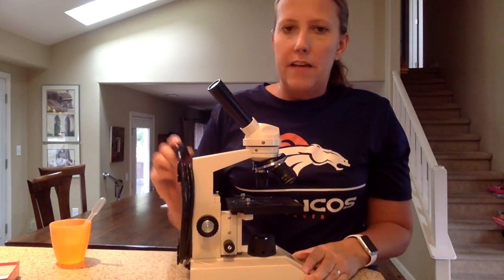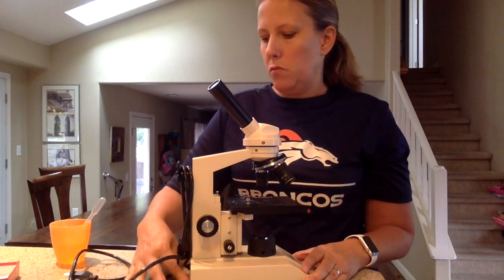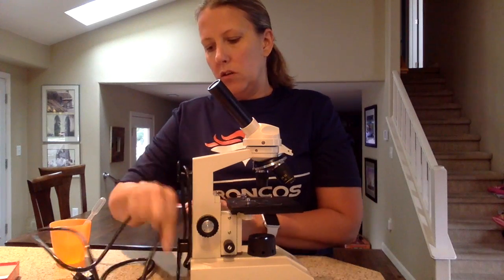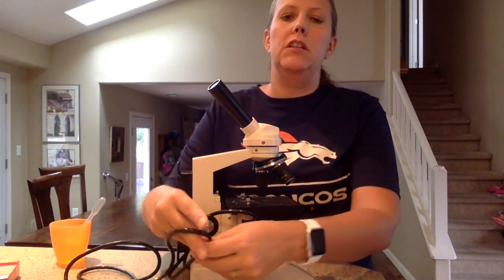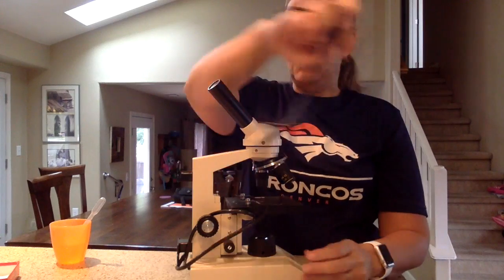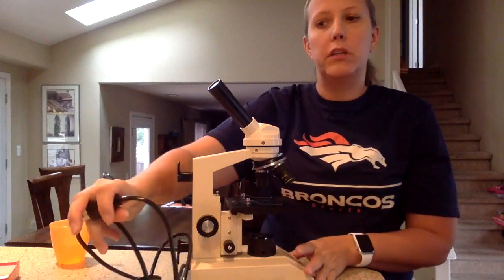Most of our microscopes have this handy-dandy cord holder on the back, so you can unwind the cord. If you don't have a handy-dandy cord winder, then the cord should just be loosely wrapped around the base like this. Either way, you're going to unwind the cord and plug it in.